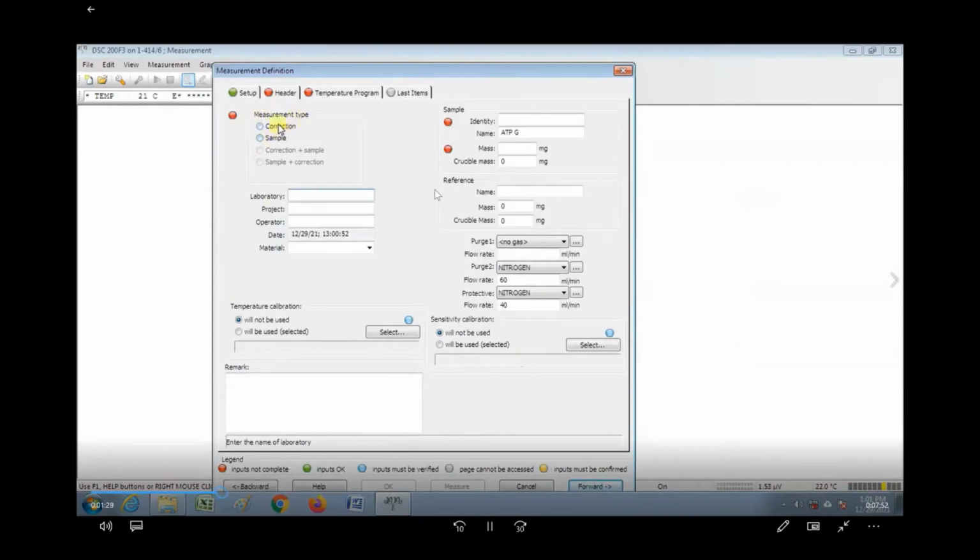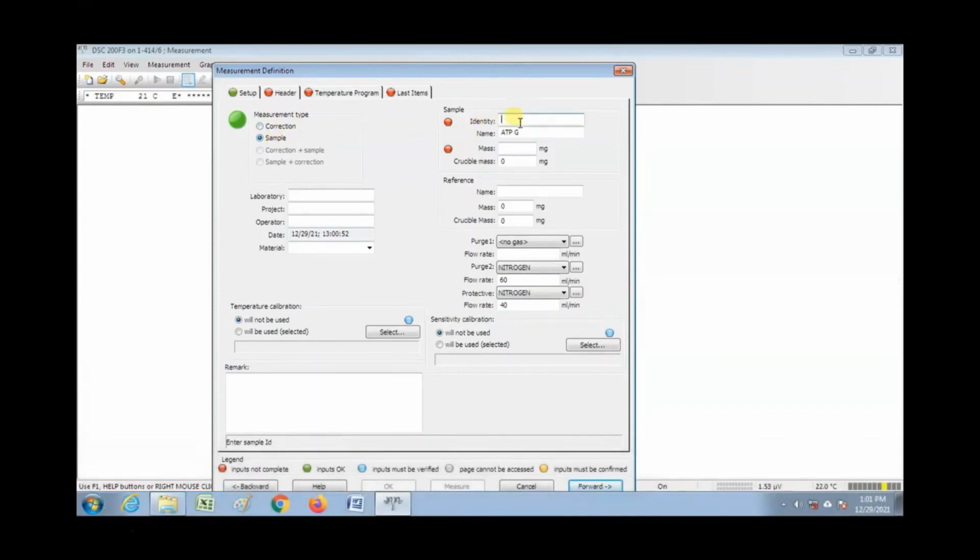Here we'll provide all the sample details, like we will give a specific name to the sample, for example, we can put any name which we want our file to be saved as. We'll put here sample S1. Now it is important that we have already taken the weight of our sample and we'll put the mass which was measured, which is 48 mg here.